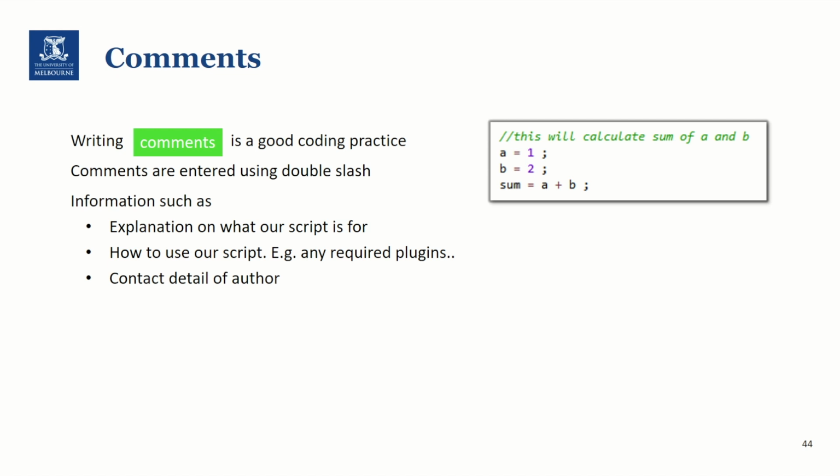Writing comments is a good coding practice. Comments are entered using double slash, and we can add comments to explain what each segment of our script is doing. And this explanation is most of the time for my future self than any others. Without the proper comments, when we revisited our own code, it will take a long time to remember on what we have done.